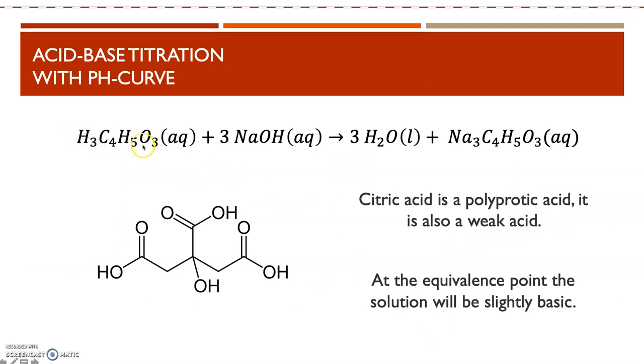This week we'll be looking at citric acid in the drinks that you looked at last week. We will not be using Hawaiian Punch because that also has vitamin C, which is ascorbic acid, and then you're detecting total acid concentration, so we're not going to look at that. So we're just going to use the other 3 drinks and look for citric acid.